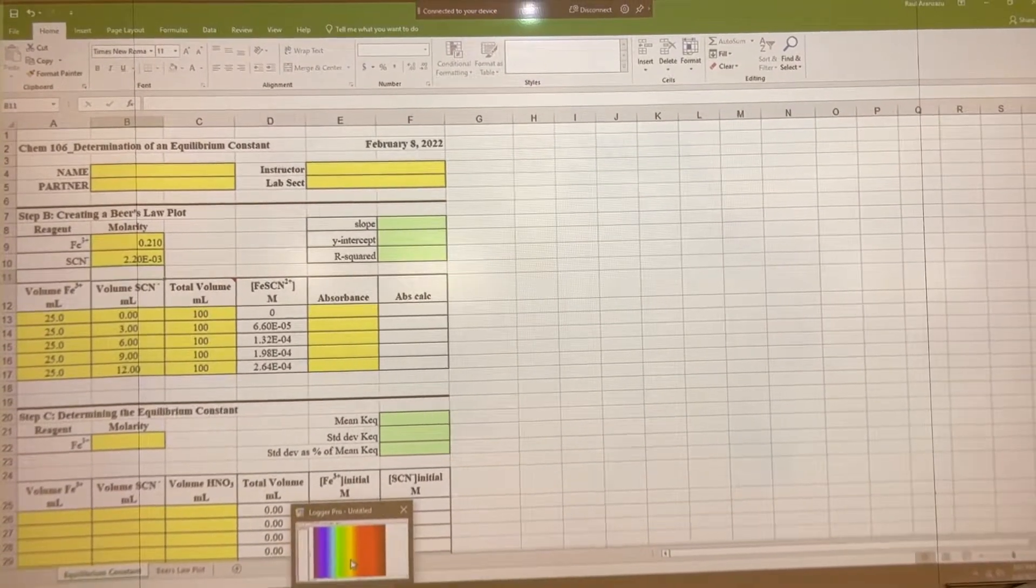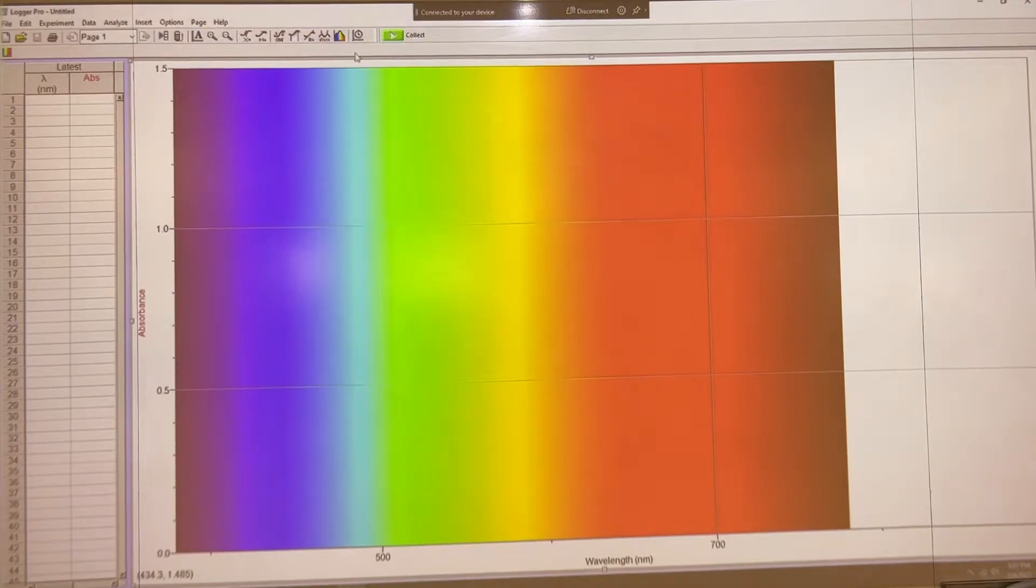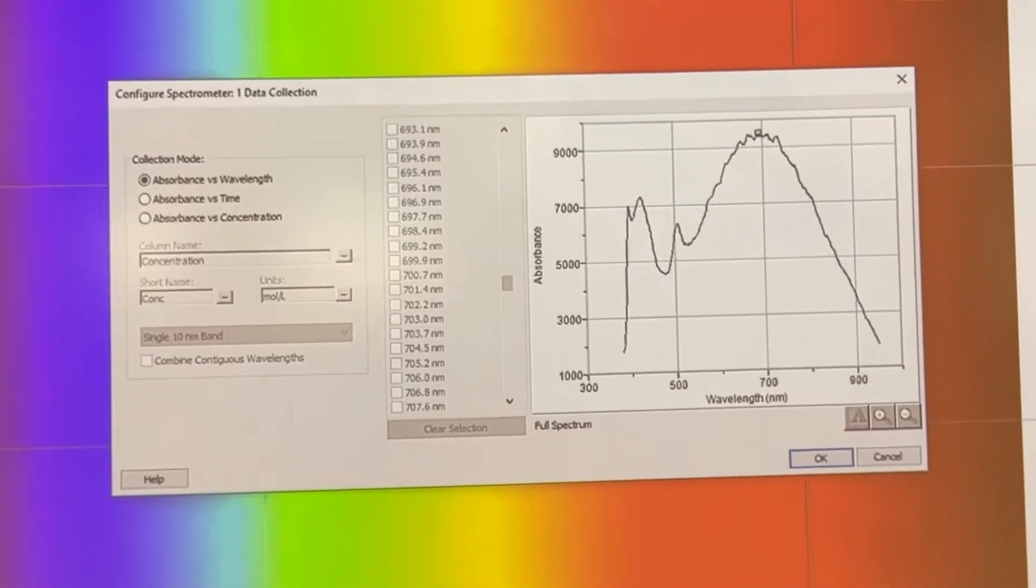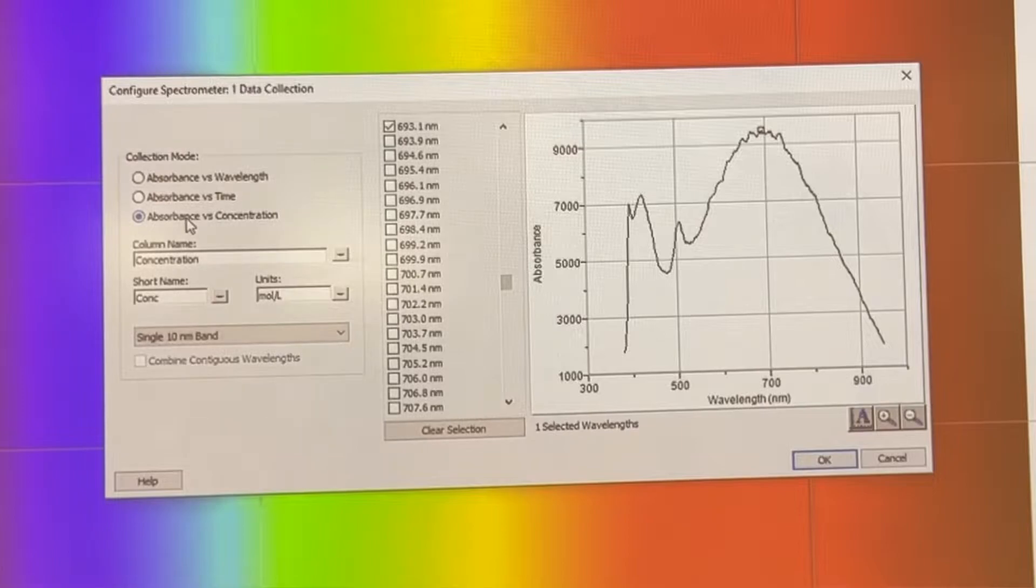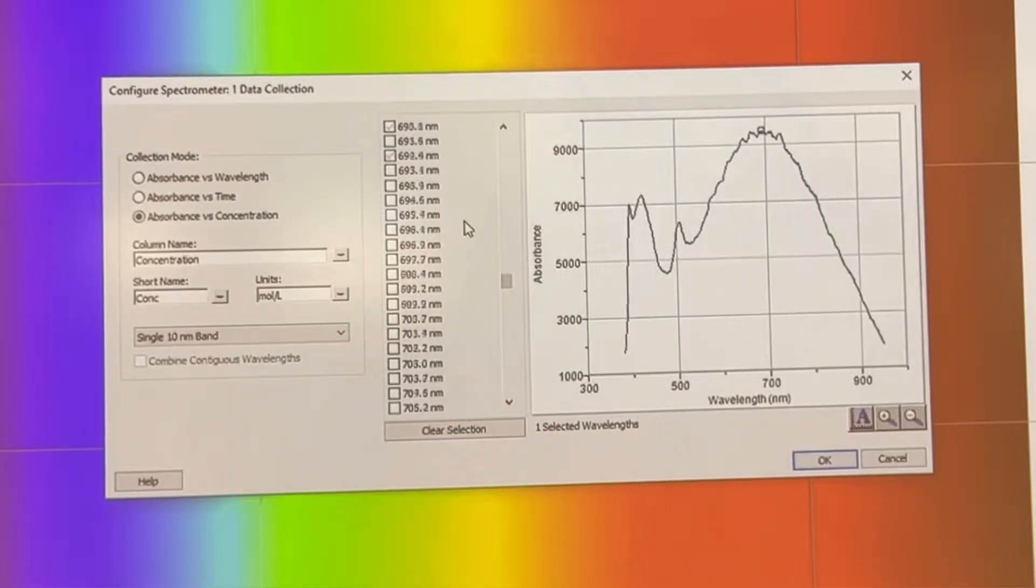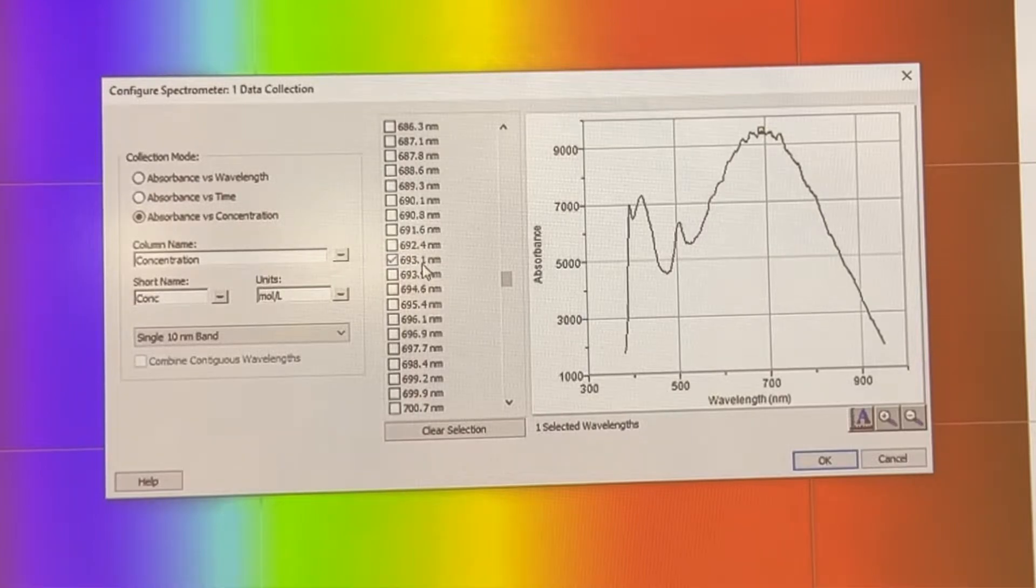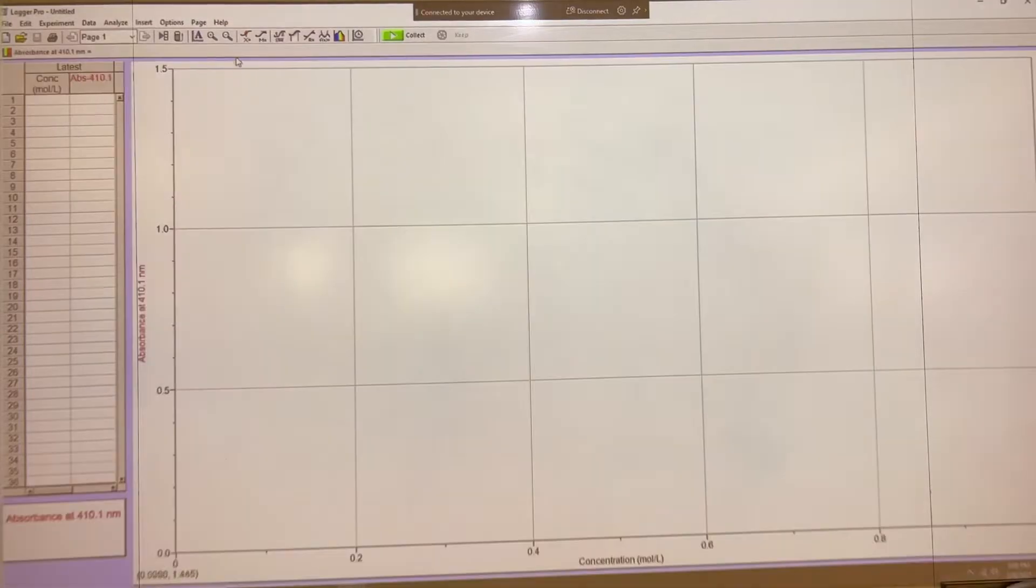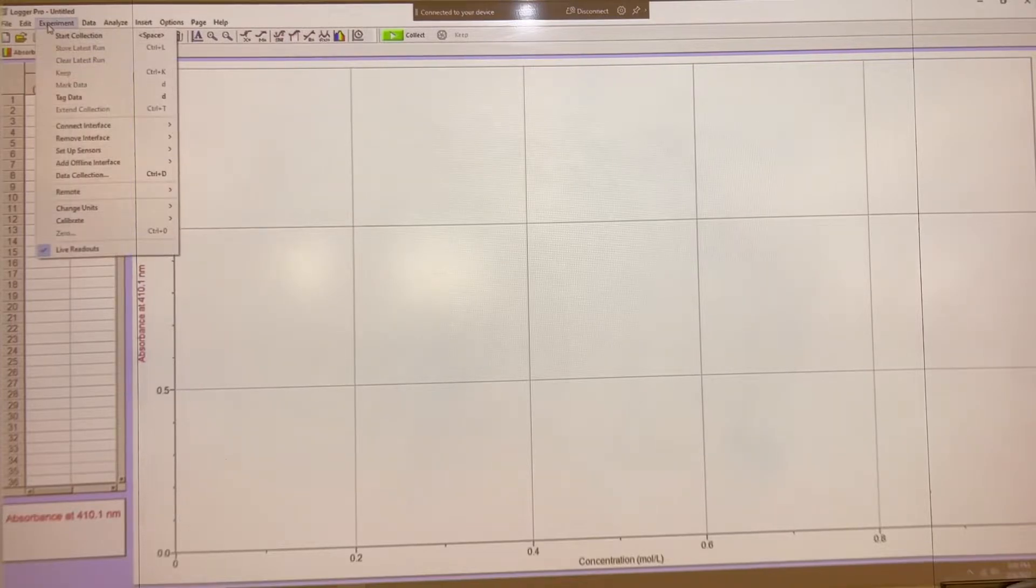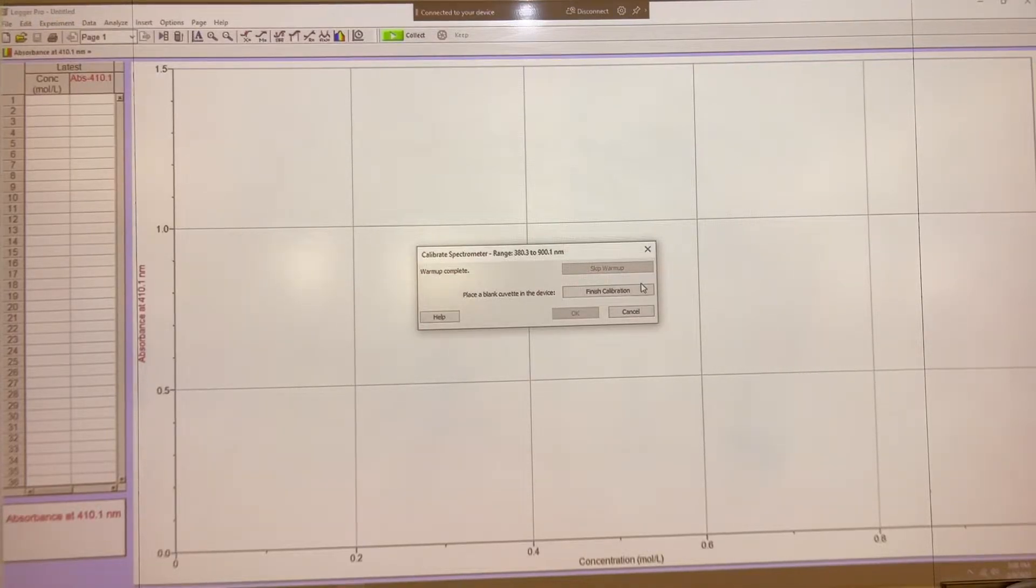Now we've got to calibrate it. We have to adjust our parameters here to go absorption versus concentration since we're looking at concentration. And then this gives us an option to select a wavelength at which we'll be reading. We're trying to find anything that's close to 410 nanometers. 410.1, that's the closest we'll get, so that's fine. We'll hit OK. Then now we've got to calibrate it. We'll go to experiment, calibrate our spectrophotometer here. The spectrophotometer is all warmed up.